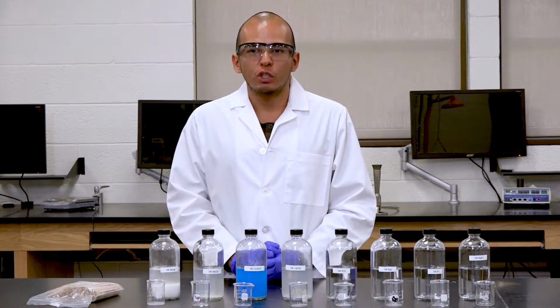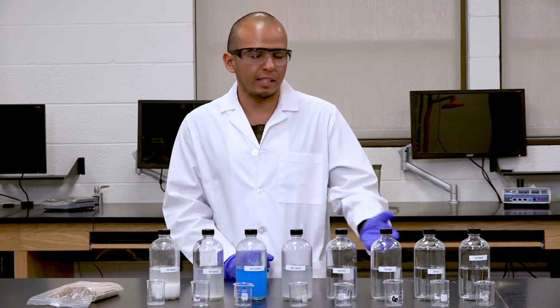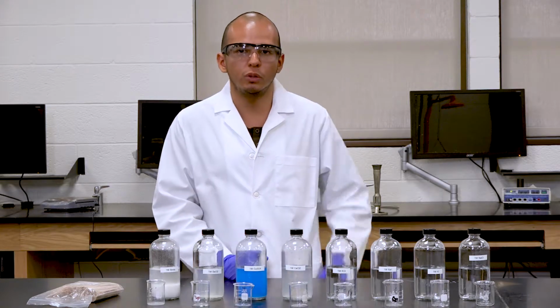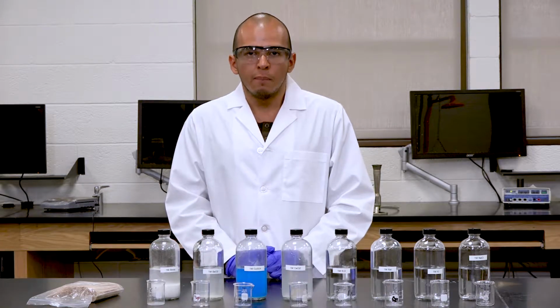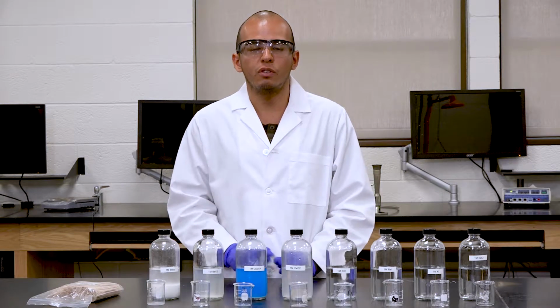So before we start the experiment, make sure we have safety goggles as well as gloves, because we are going to be dealing with corrosive chemicals like hydrochloric acid. And if you have long hair, please make sure you tie it back and make sure you have closed-toed shoes at all times and are wearing a lab coat as well. Be sure to dispose of all chemicals properly by their acid or base waste, or down the drain only if your TA allows it.